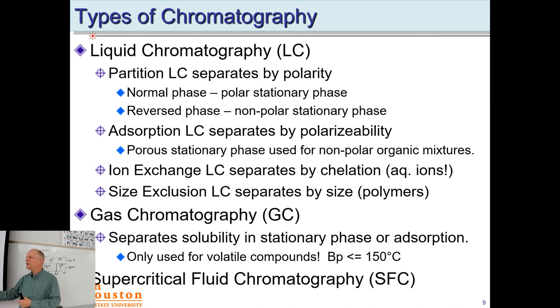Now we have polymers. So we'll have a long polymer inside as a stationary phase, and it'll have a lot of benzene rings and things like phenyl silanes and so on. So silicon polymers that are really high temperature resistant. And then they'll have a lot of aromatic groups. So a very interactive stationary phase that will hold back nonpolar molecules and let the polar molecules elute first.